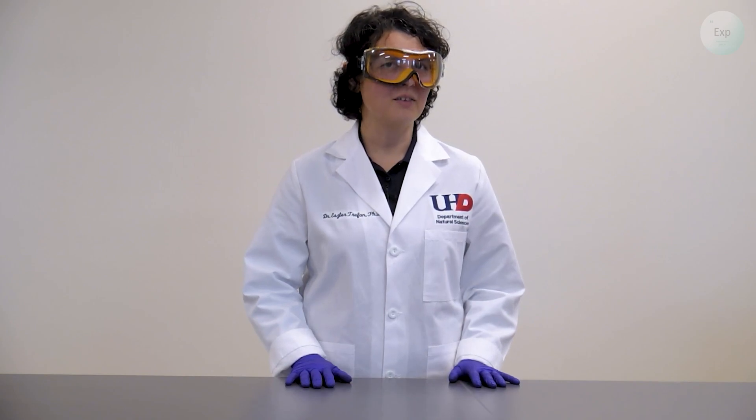Hello, my name is Dr. Esther Trofan, and in this video I'm going to demonstrate how to separate water from hexane.